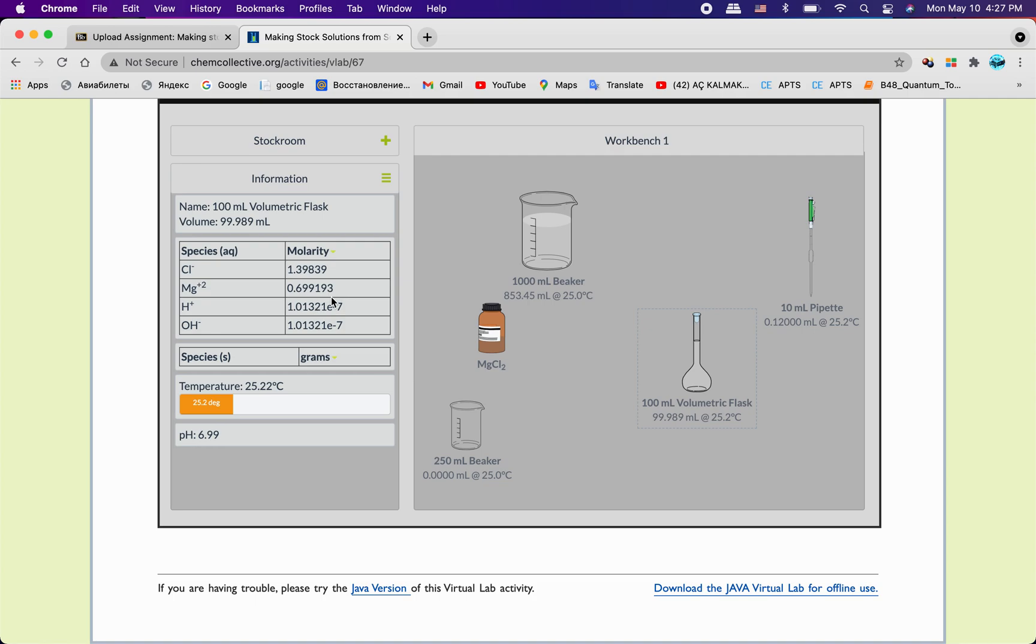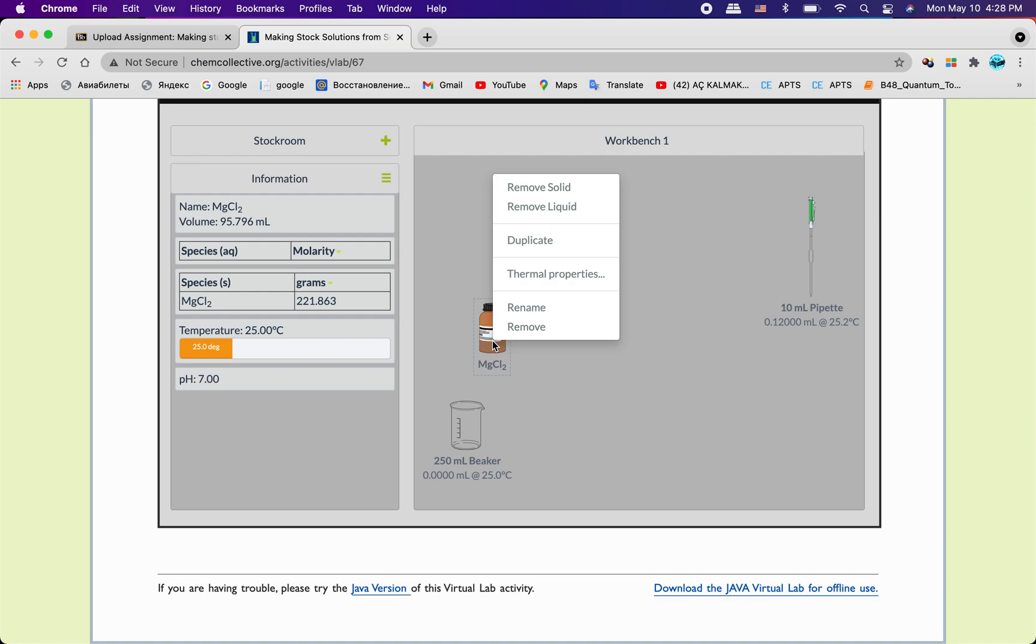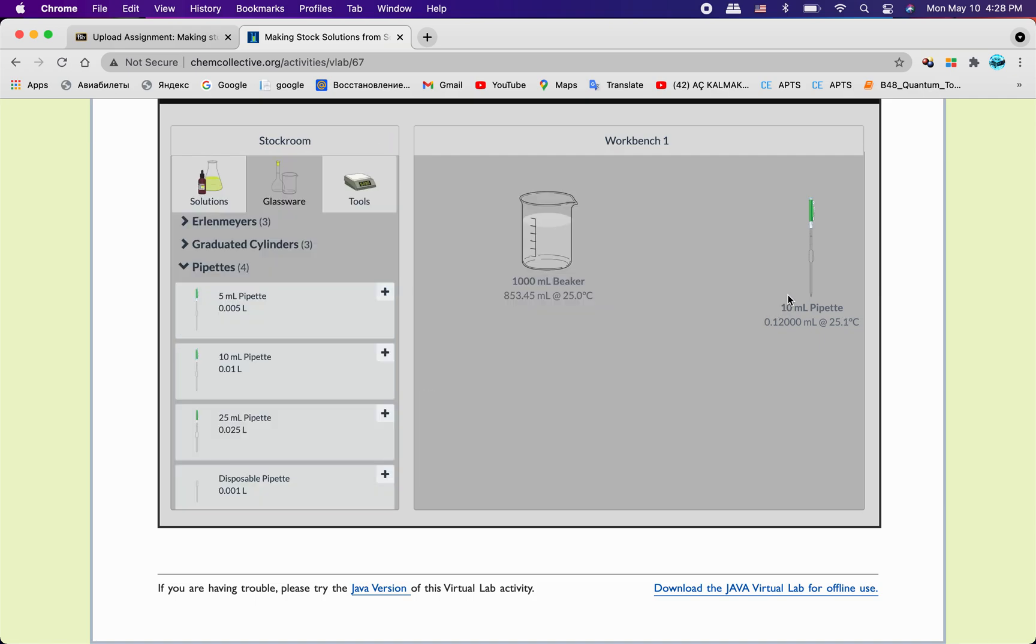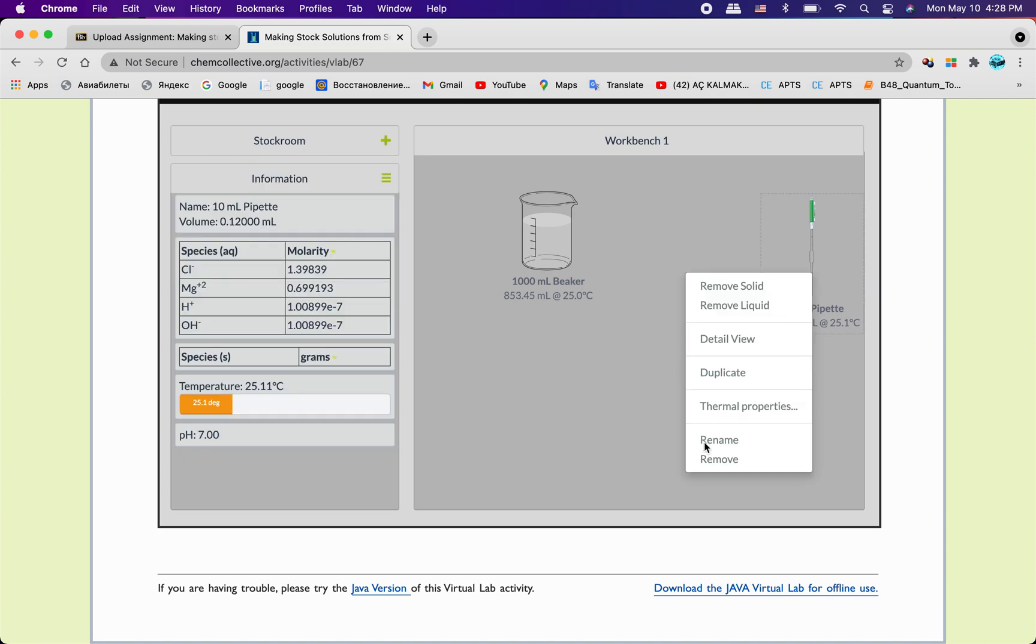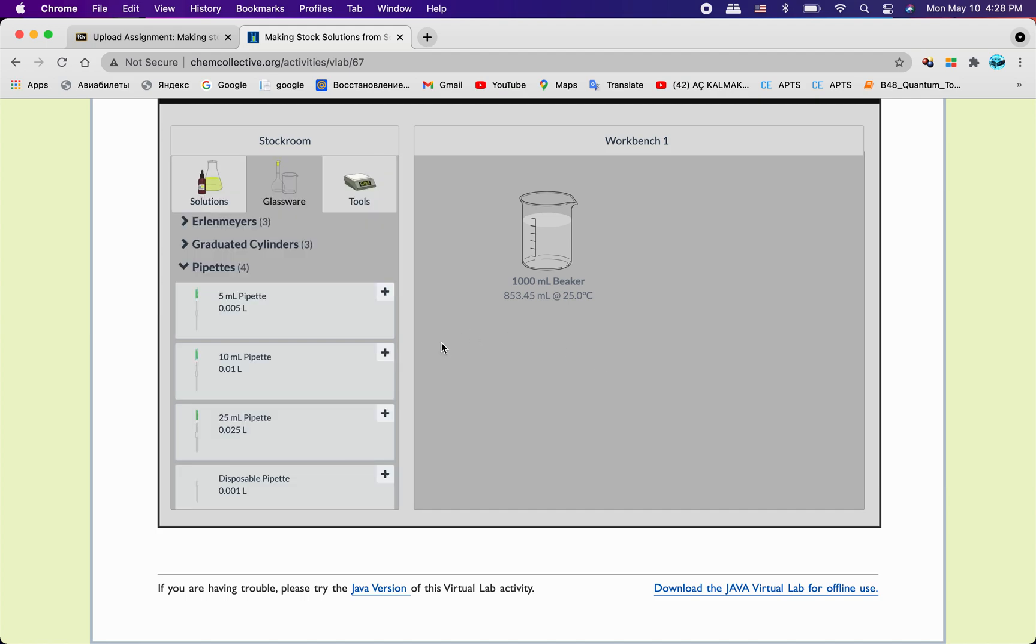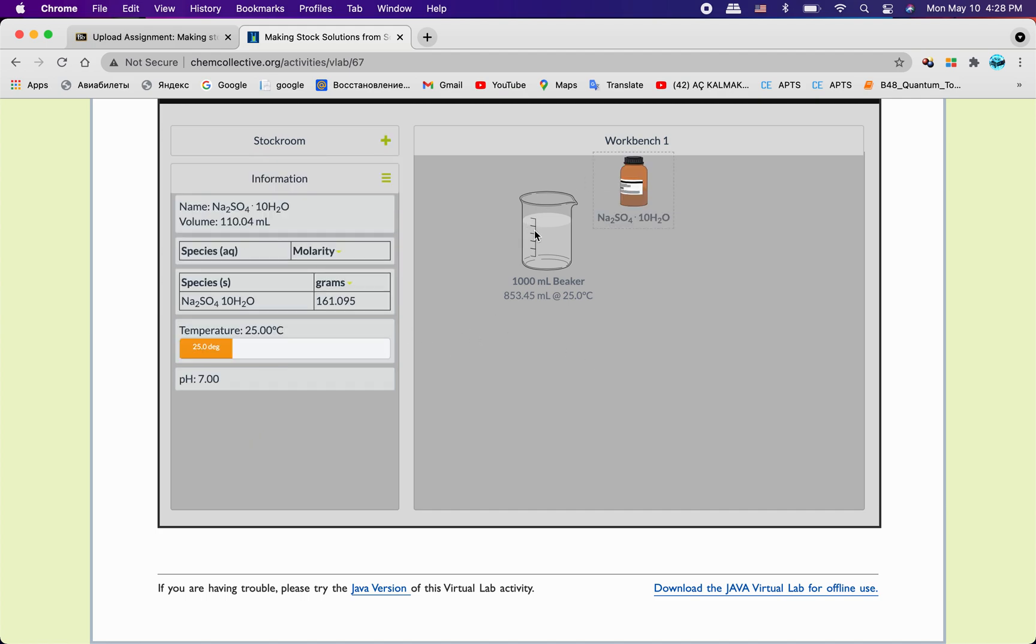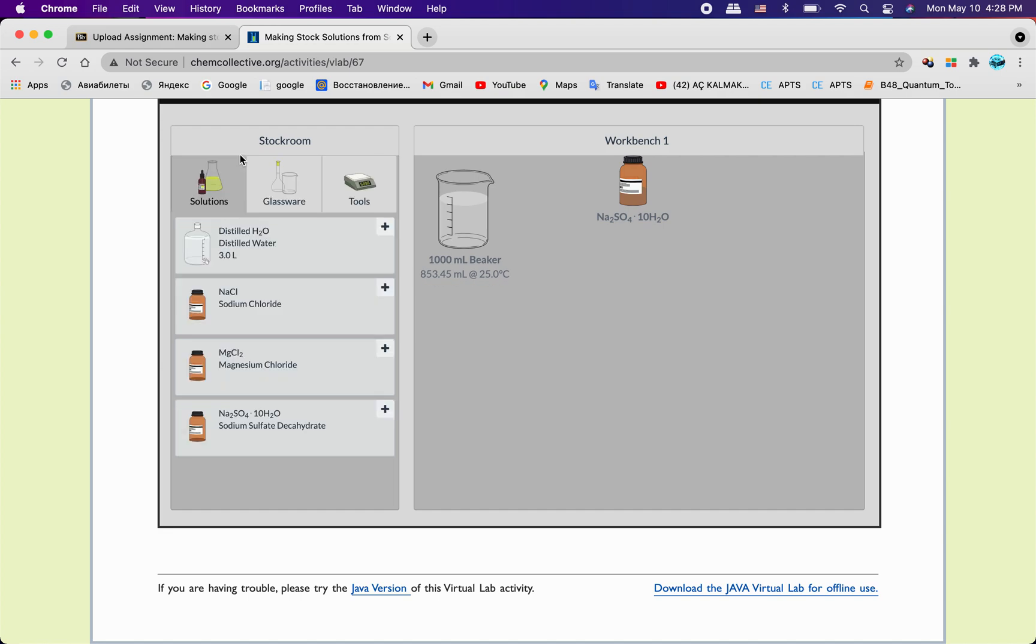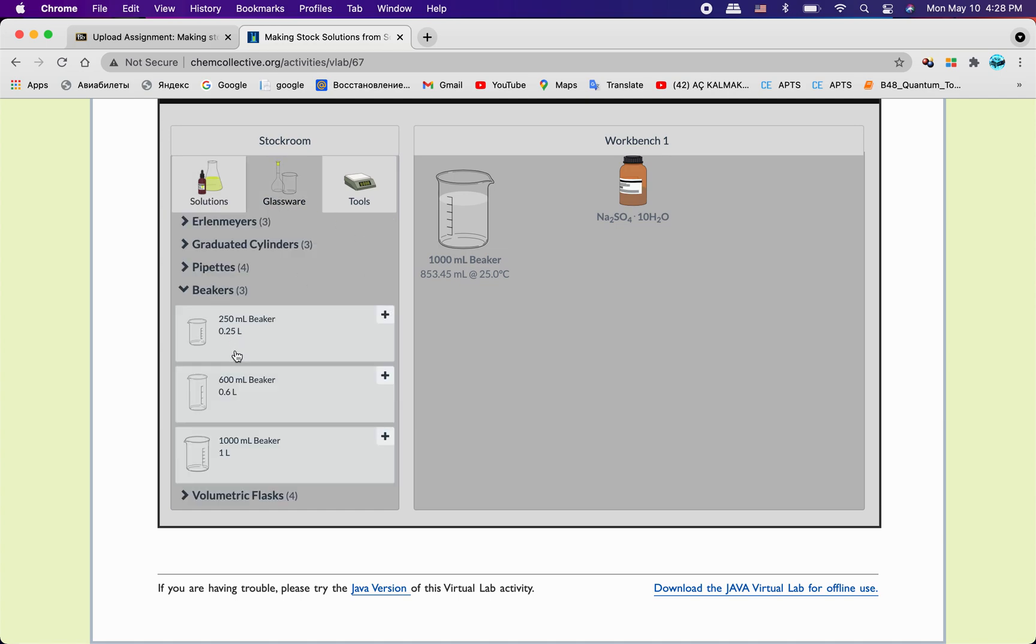Let me remove these ones. We have right here sodium sulfate, and that's what I need. I'm not gonna check and remove that, and I'm gonna use, I will need zero point 25, one volume beaker.